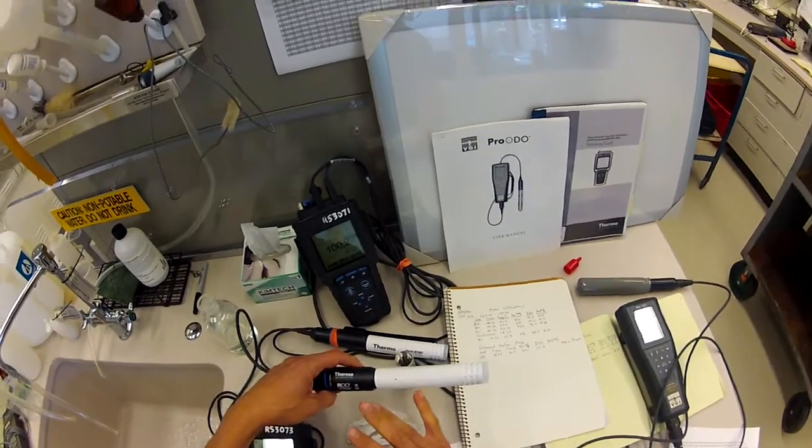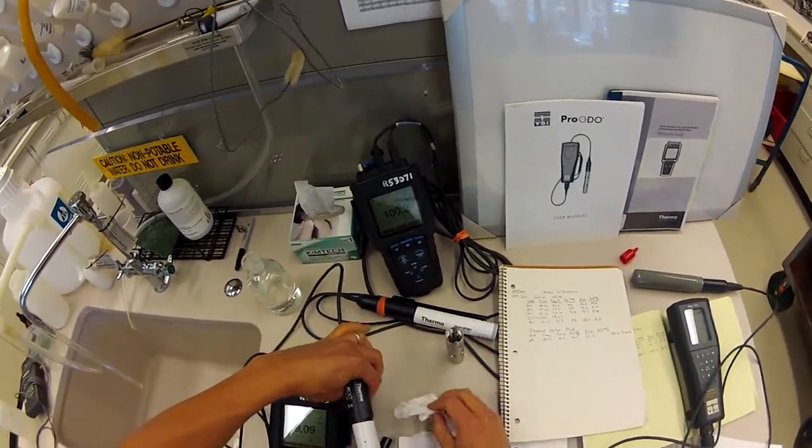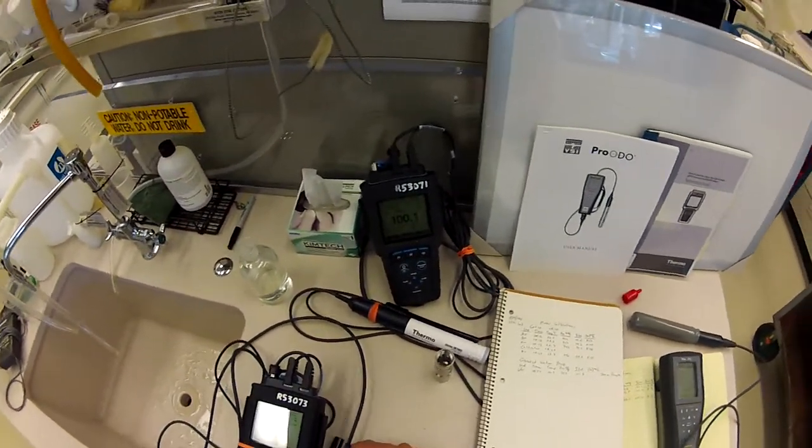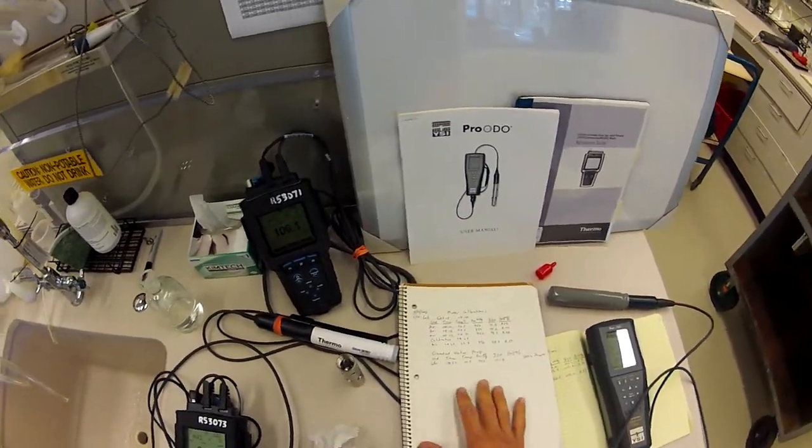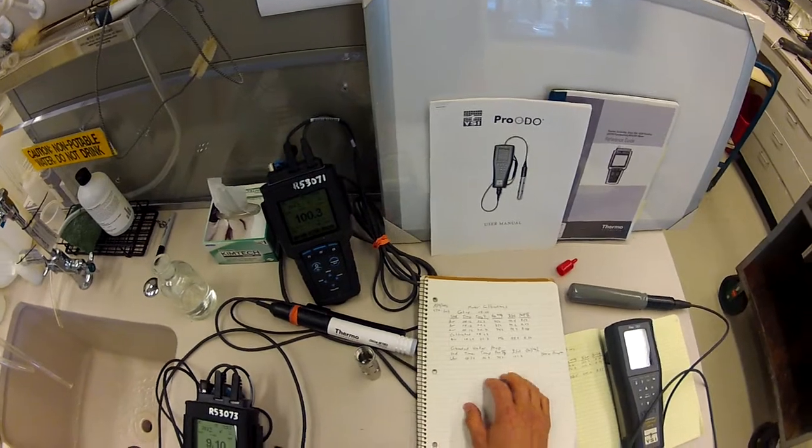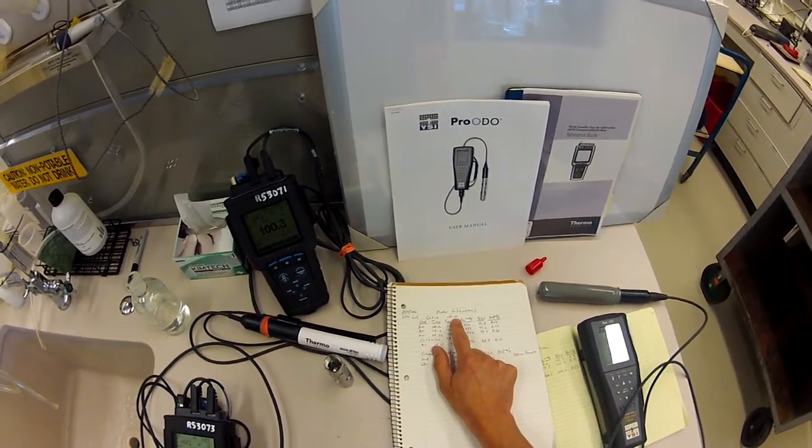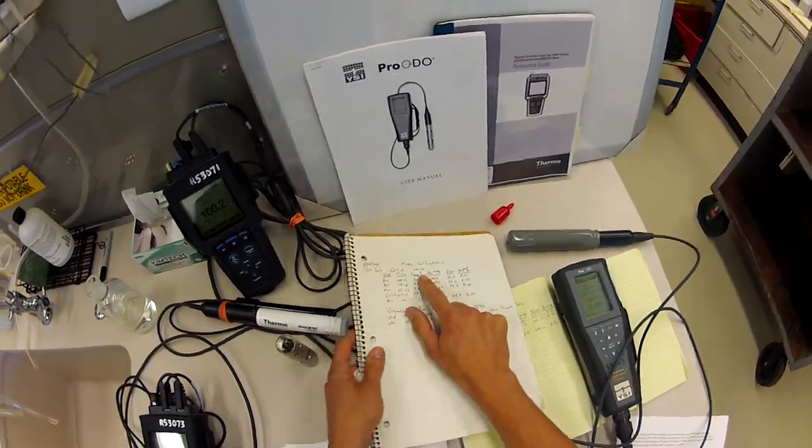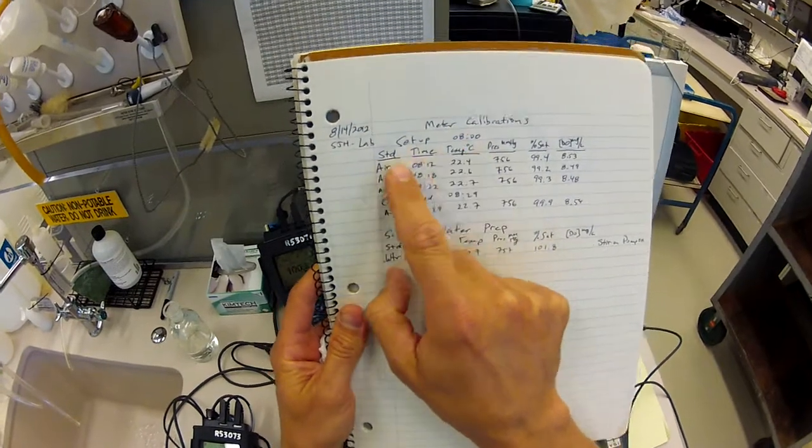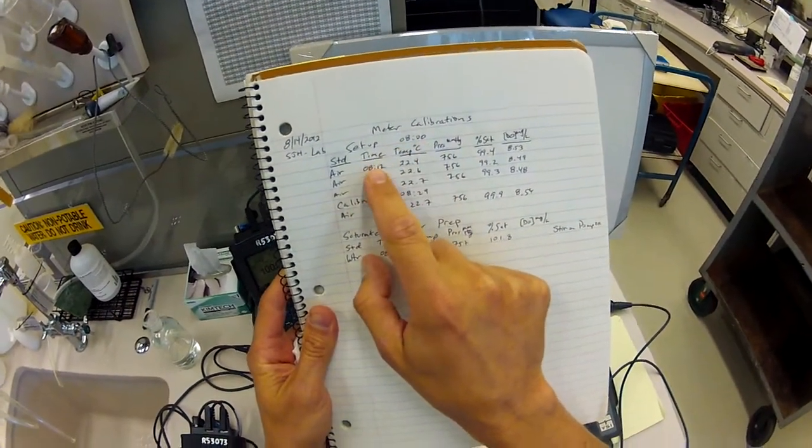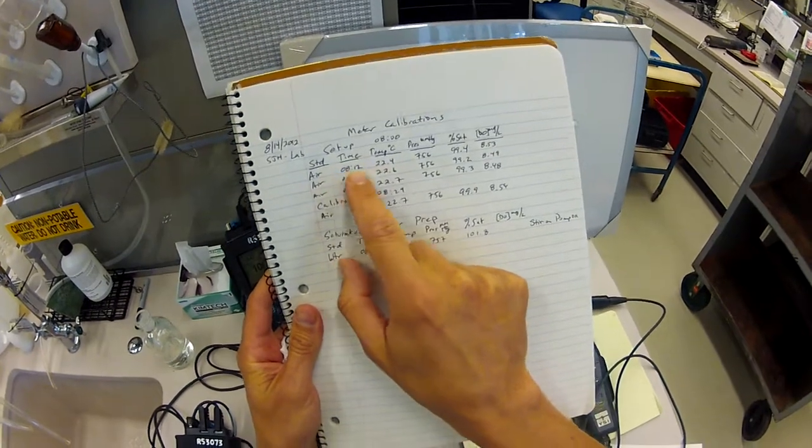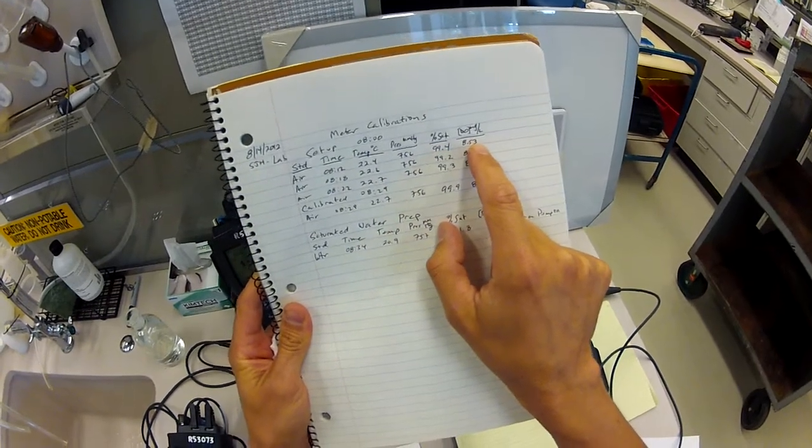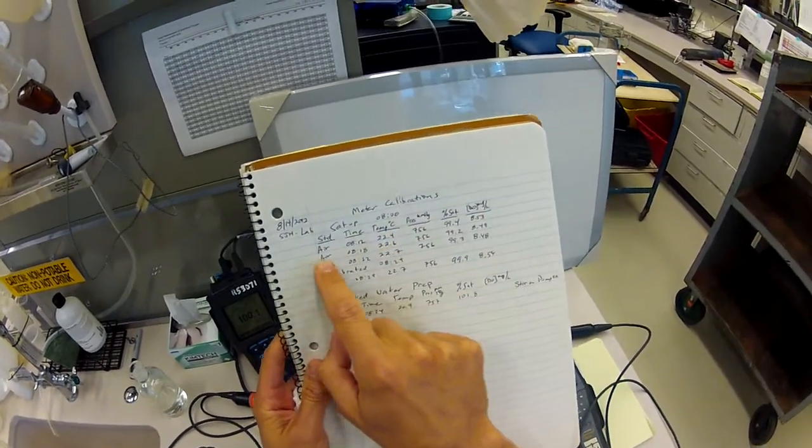So now that I've got this in here, I need to leave it in there - that's another key component. Once I open it up, I'm gonna have to wait another 10 minutes or however long it's gonna take to equilibrate. But what I want to do in terms of documentation is, once I've got that put in, I'm gonna write down in my book here - I've got the date, my initials, and where I am. I've written down the time that I set it up, and if I set this up at 8 o'clock, I really could have taken my first reading at 8:05 and gotten all of the data here. I've got an air standard, I've got a temperature, pressure, percent saturation, milligrams per liter.